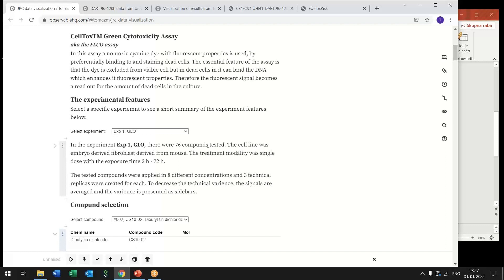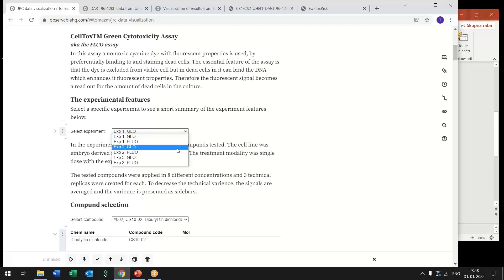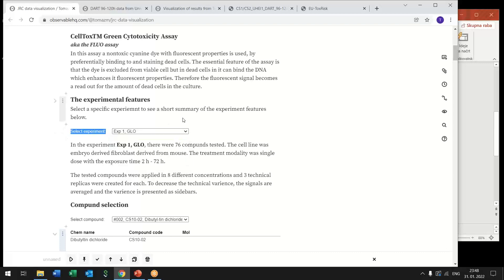So there were three different experiments done and each was analyzed with both of these assays. So in total there were six data sets or six experiments. So user can now select one of these experiments.